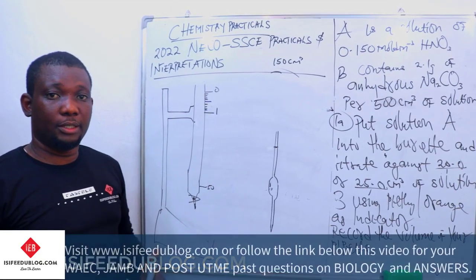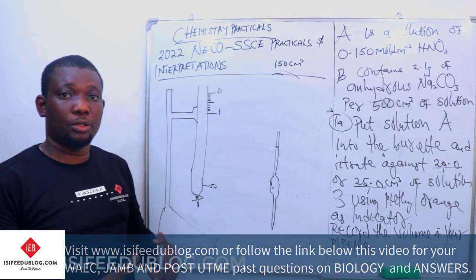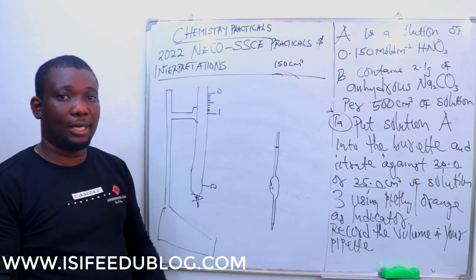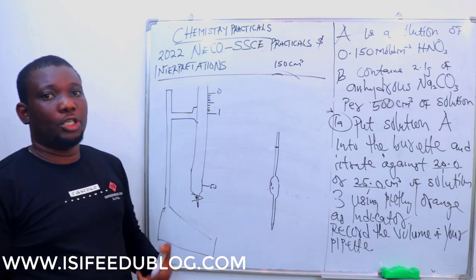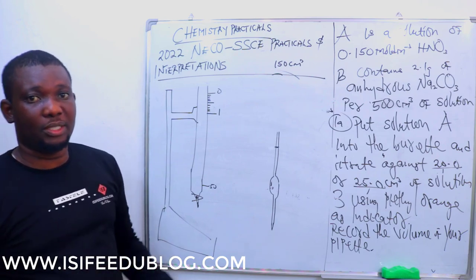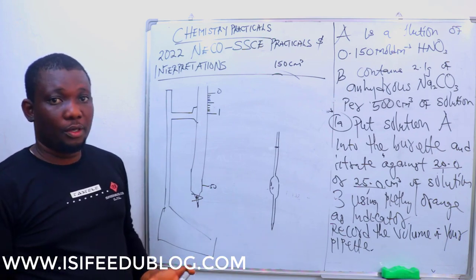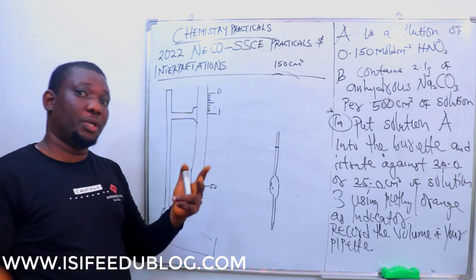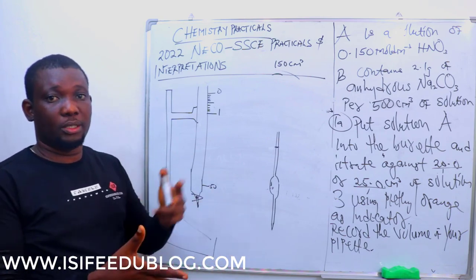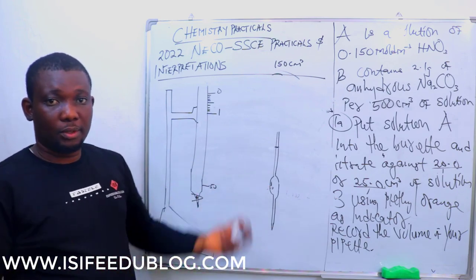That's why in titration, we have what is called a standard solution, a solution whose concentration is accurately known. Those concentrations that are not known accurately can be standardized using titration. Titration is one method we use in volumetric analysis, or quantitative analysis of this sort. Acid-base titration is one of the aspects of titration. There are several types of titration. The one we did in the previous video was another aspect of titration, to do with redox titration, iodometric, oxidometric.